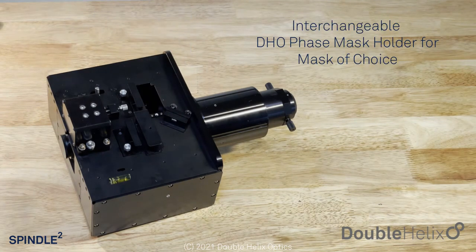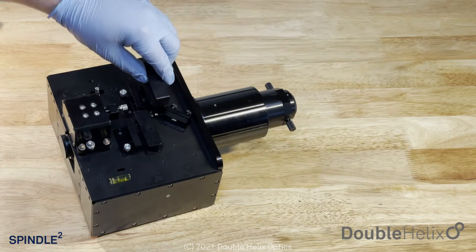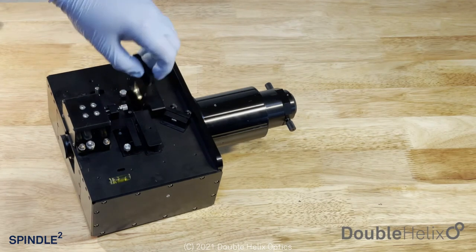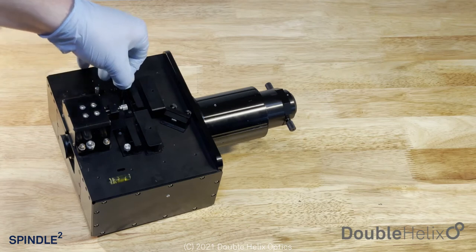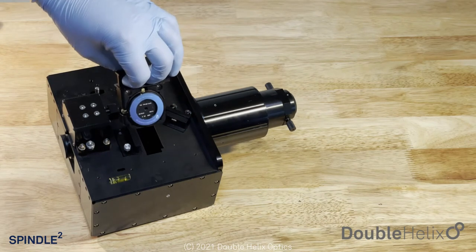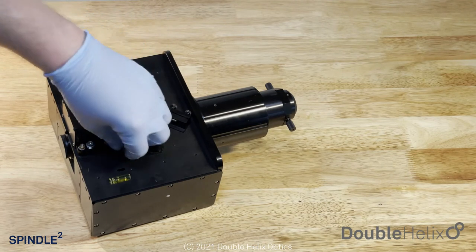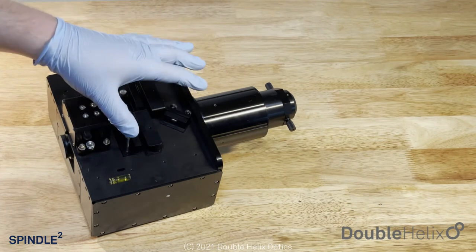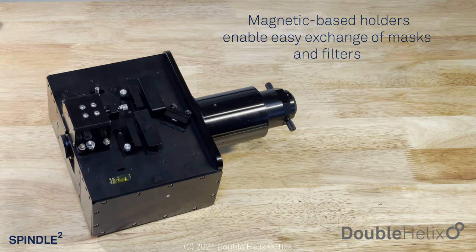Along that path, we have our phase mask cartridges. This one has a double helix phase mask in it right now, and it can also be left blank. We then have secondary emission filters — right now nothing's in there. We have an alignment lens which you can pull up to engage or push down to move out of the way. That's repeated on the transmitted side: we have our phase mask, our secondary filter cartridge, and our alignment lens. Heavy use of magnets means everything just clicks in and out of place, making it really easy to swap phase masks or move from engineered PSF mode to clear aperture mode.